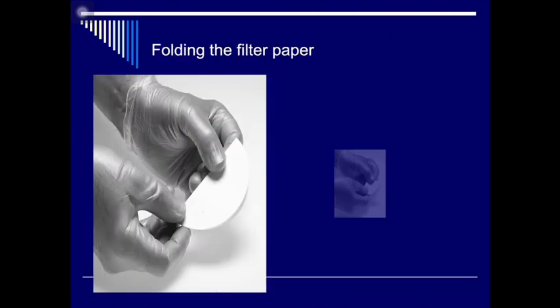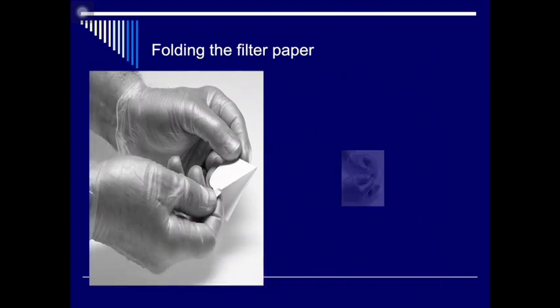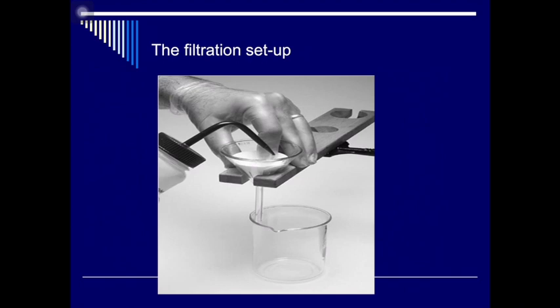After removing all the chlorides, okay, so this one is how to fold the filter paper. I have taught you this already. Mount your filter paper on top of your glass funnel and wet the sides with distilled water.